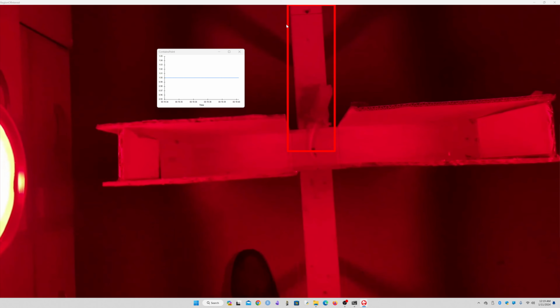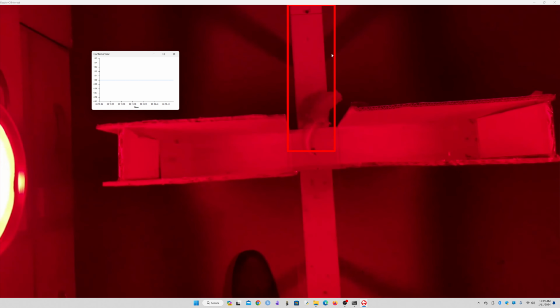So again, the mouse is always in this ROI in this clip, and this clip is a total of 30 seconds. So at the end, when I finish analyzing my CSV file output, I should get approximately 30 seconds of this mouse being inside the ROI.